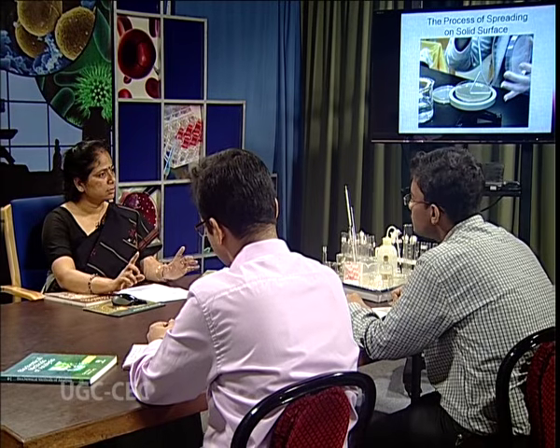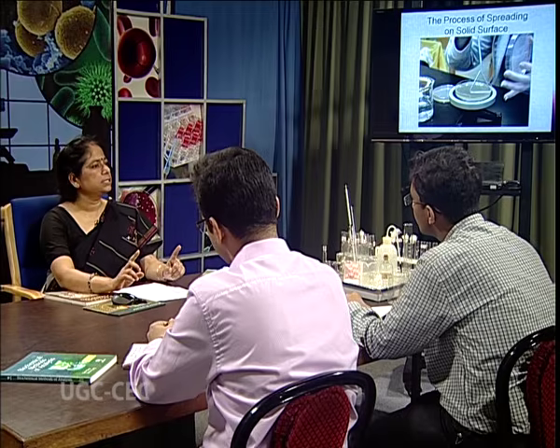Ma'am, I have a question. What are the advantages and disadvantages of the spread plate technique? The advantage is, when you are spreading a small inoculum over the surface, mainly the aerobic bacteria grow because you are spreading it onto the surface of the solid agar media. But the disadvantage is, in the mixed population you have aerobic, anaerobic, facultative anaerobes, and facultative aerobes.